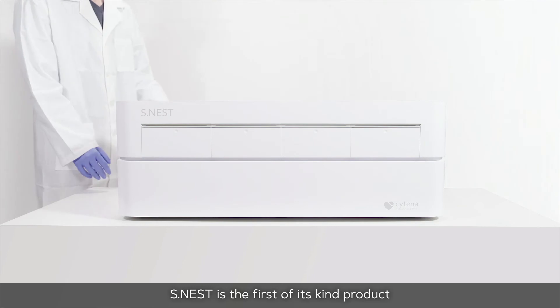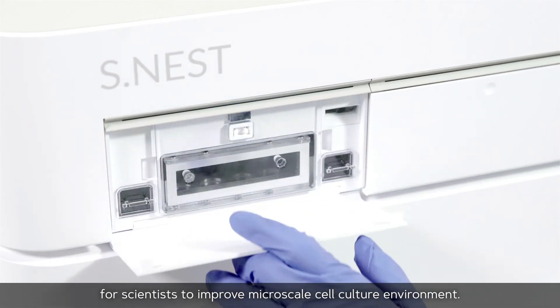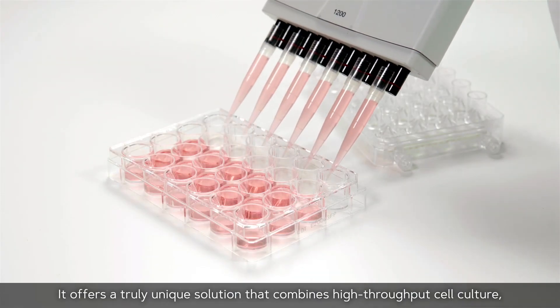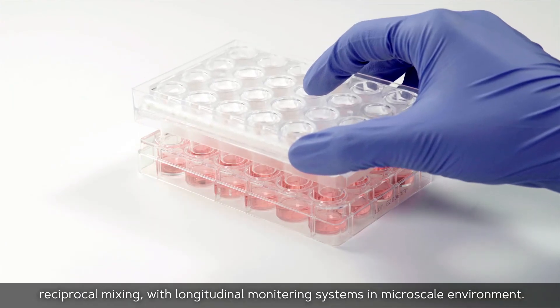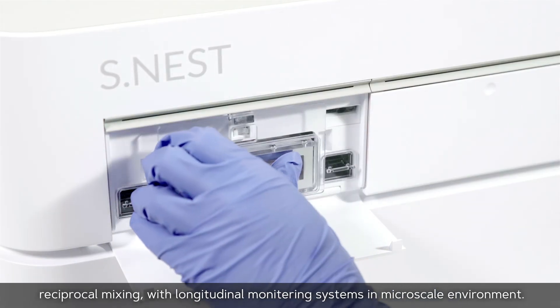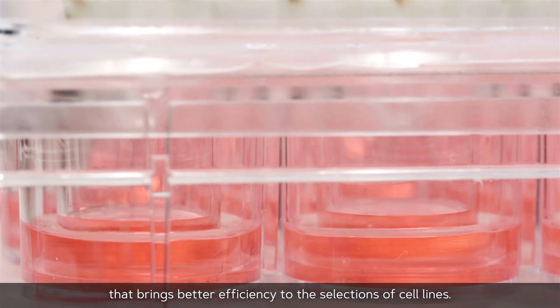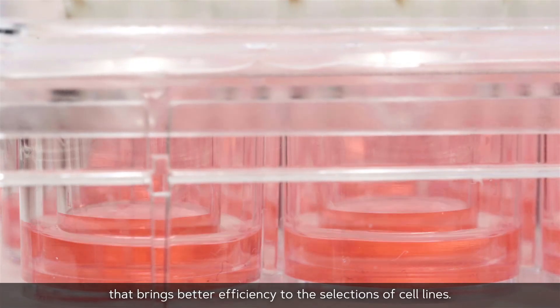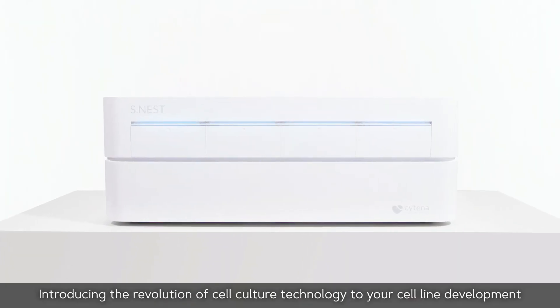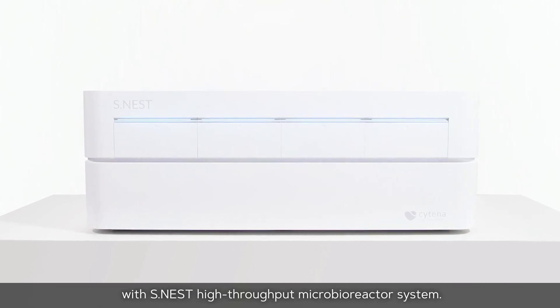S-NEST is the first of its kind product for scientists to improve micro-scale cell culture environments. It offers a truly unique solution that combines high-throughput cell culture, reciprocal mixing, and longitudinal monitoring systems in a micro-scale environment. S-NEST is a fully integrated system that brings better efficiency to the selection of cell lines, introducing the revolution of cell culture technology to your cell line development with the S-NEST high-throughput micro-bioreactor system.